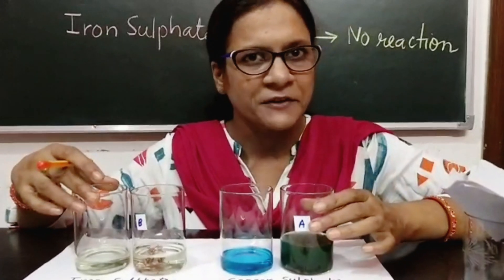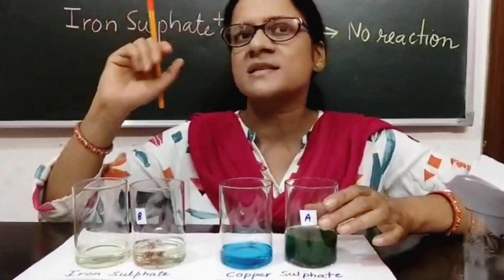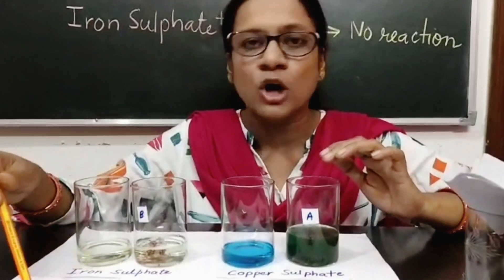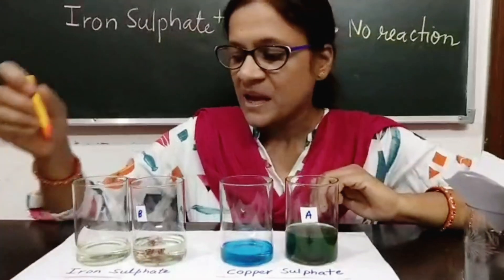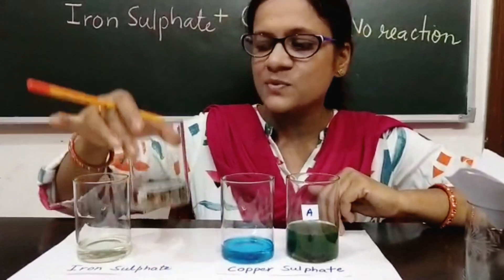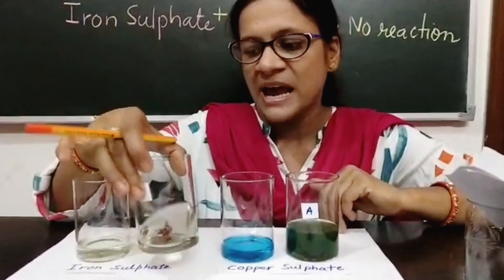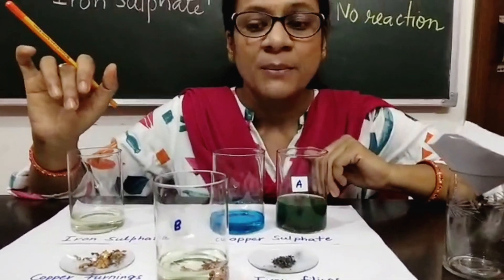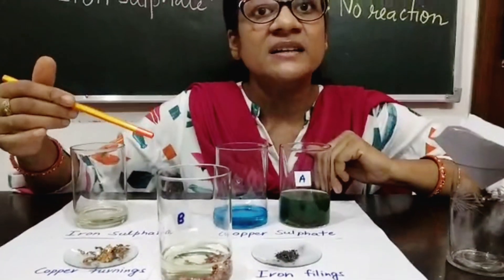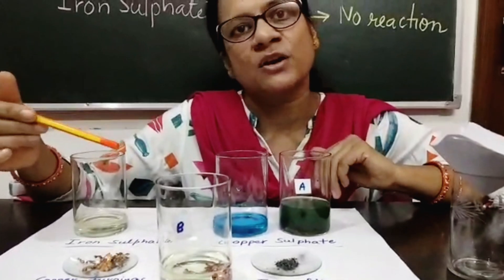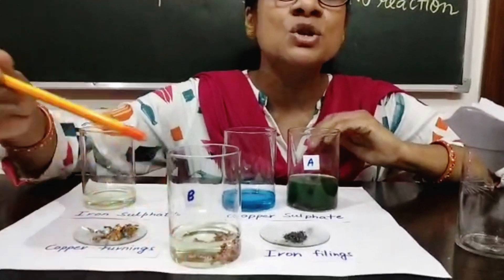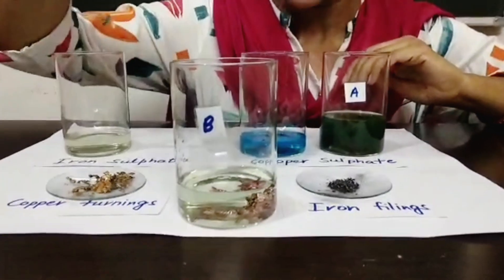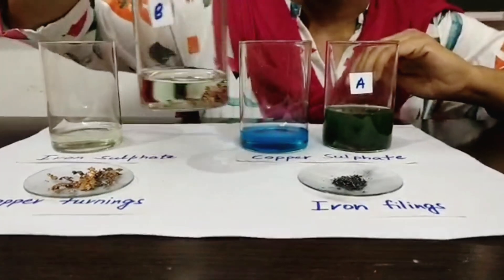We will check the results after 15 minutes. We just discussed theoretically that the reaction between iron sulphate and copper turnings does not take place. And we can see here that the iron sulphate solution is as it is — there is no reaction taking place because iron is more reactive than copper, and copper is not able to displace iron. So it remains as iron sulphate and copper only.